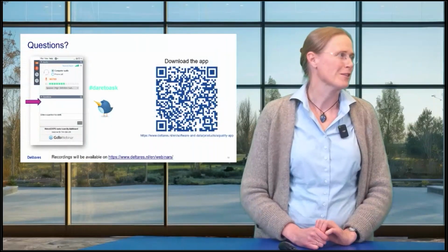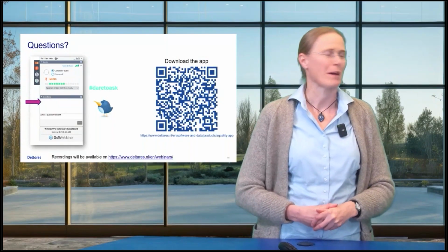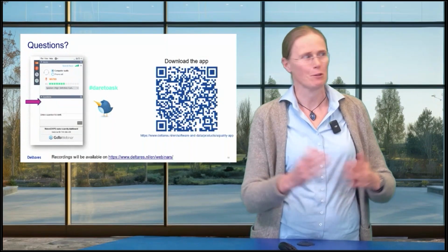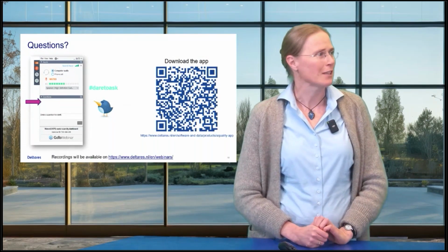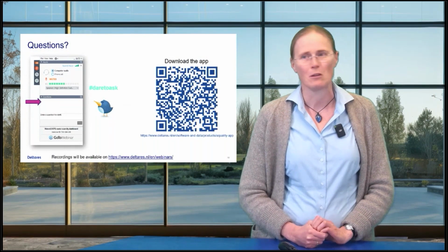Yeah, I can imagine. You see that this app has been evolving over time as well. At first it was called the nitrate app, and now we're already having more parameters in it. So that depends also on what the demands from the users are, and what can be done.